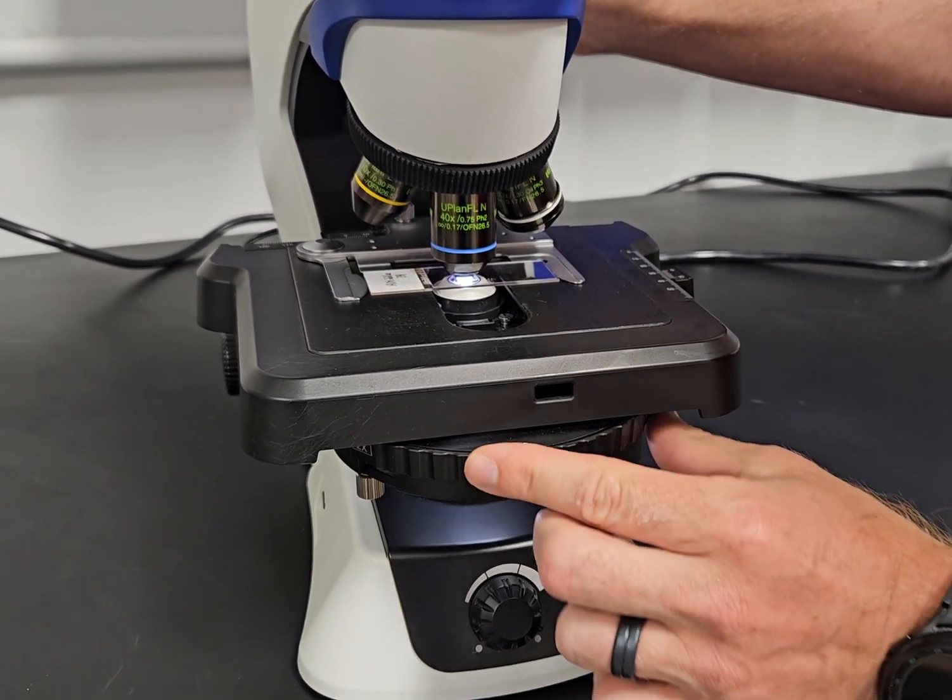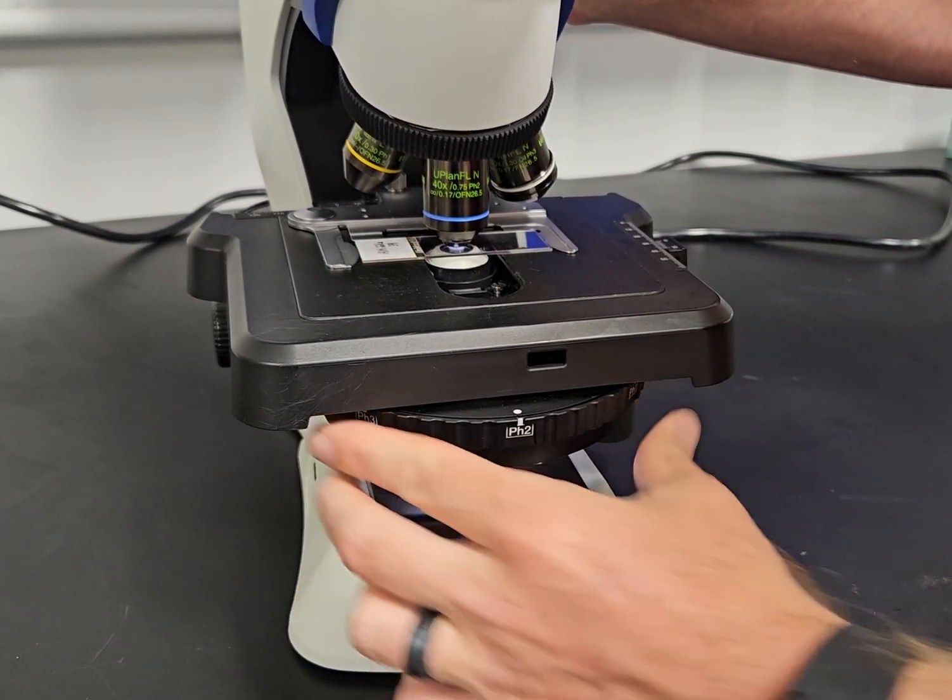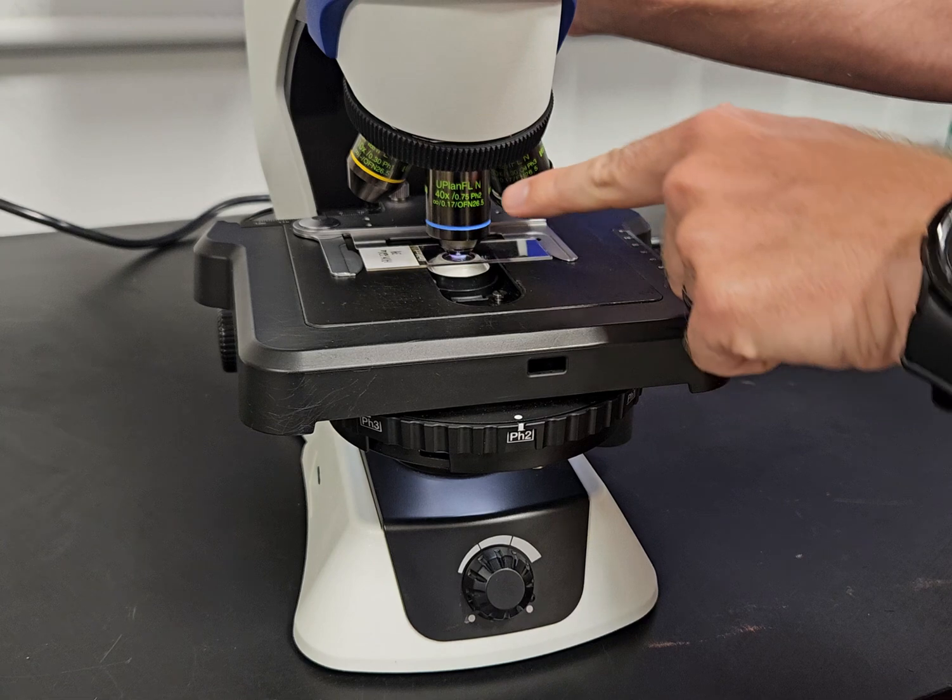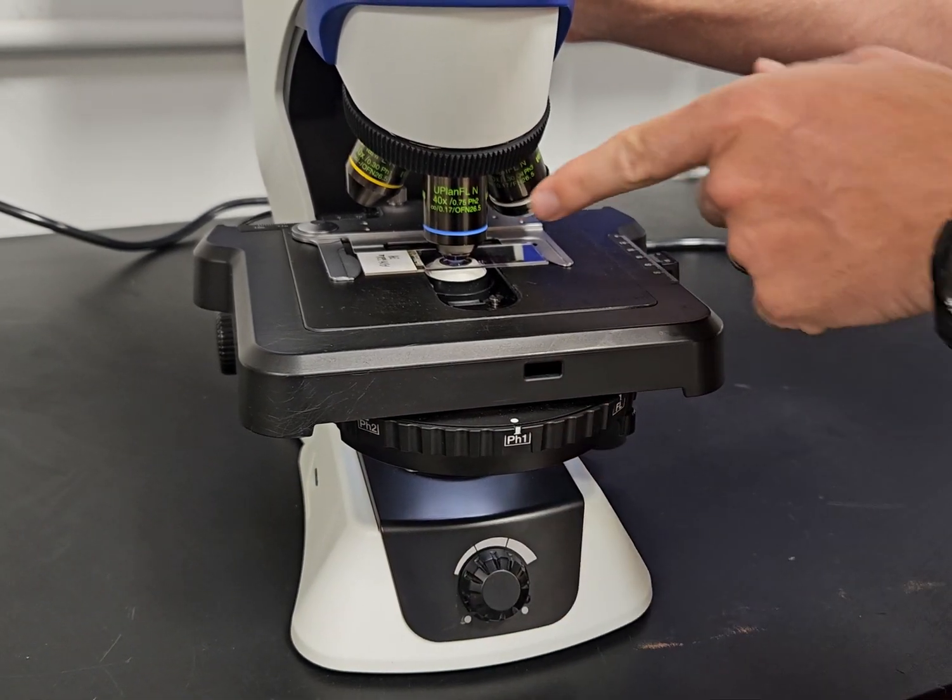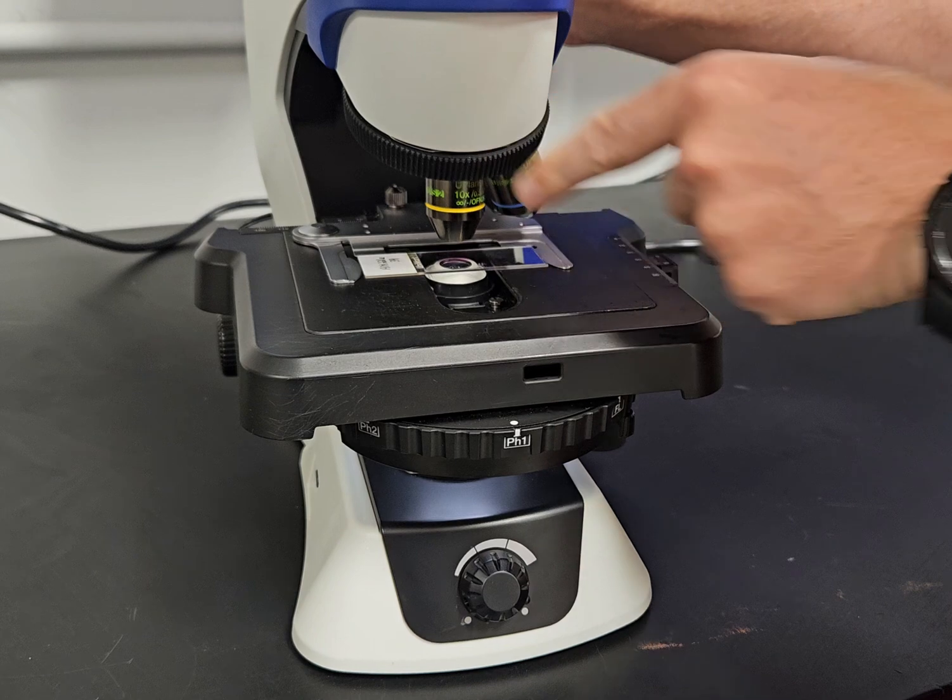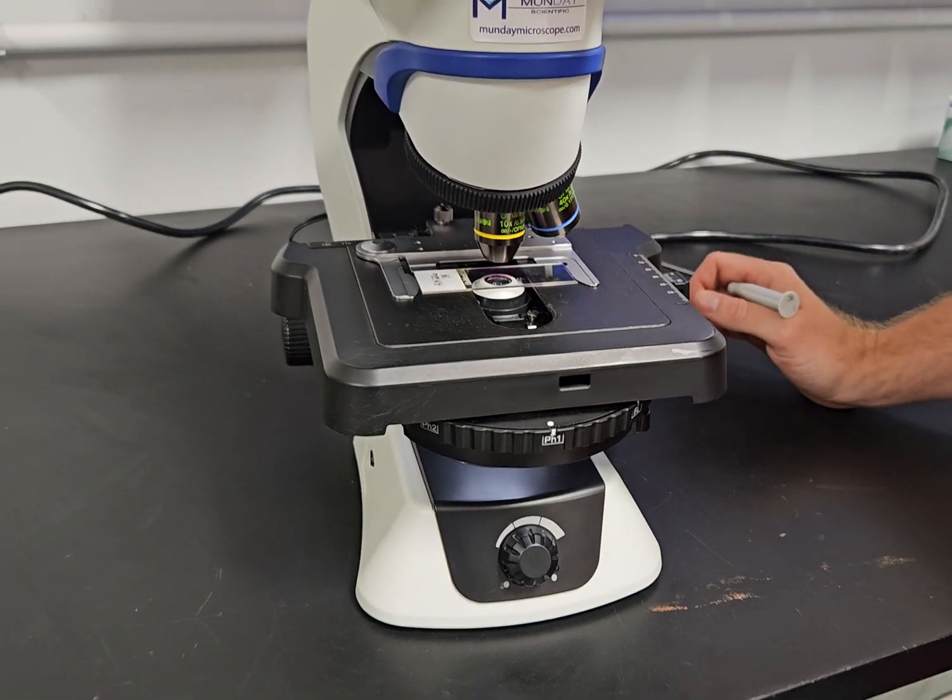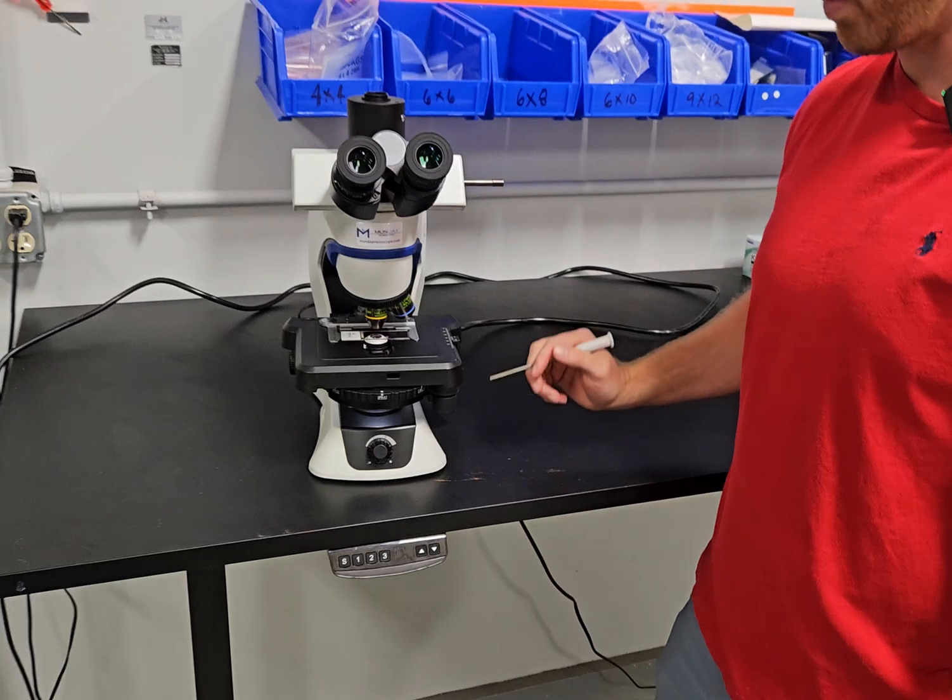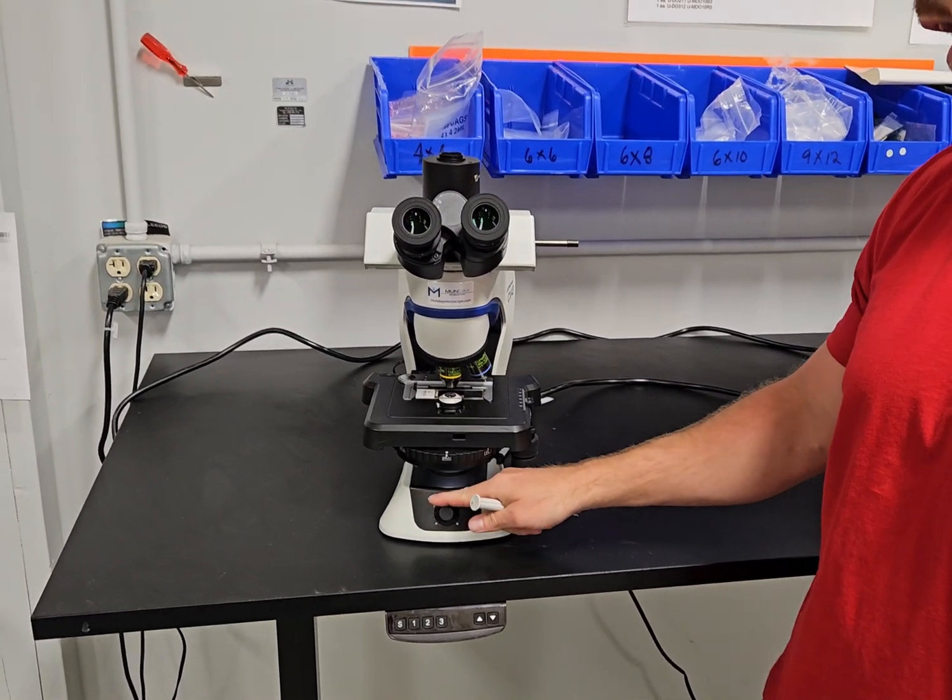You have a dark field stop, a phase three which will correspond to the 100x, a phase two pH two which will correspond to the 40x, and a phase one which will correspond to the 10x. We have made sure the phase rings are aligned on this scope, and then we have a rheostat right here which is how you control the light intensity.